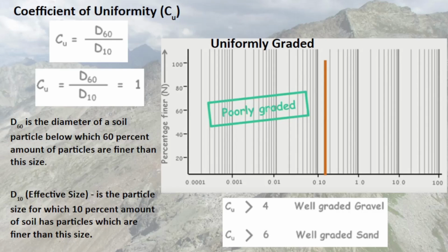So when you look at the graph, you can see D60, for example. You can find your grain size for this material. For example, on this graph, we look at 60%, and it will be about 0.5 or 0.6. Usually programs or Excel will tell you. What does it mean? It means that 60% of the material, of this particular size, 0.6, is finer than this size. So 60% of material is finer than the size of your bulk material. So that's what it means. Same for 10, 30, and 90. Laser sizers usually show 90 and 10.